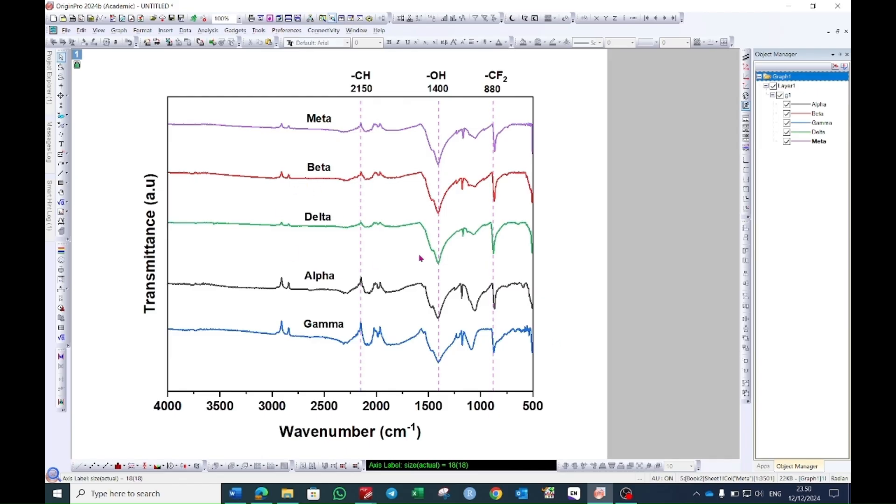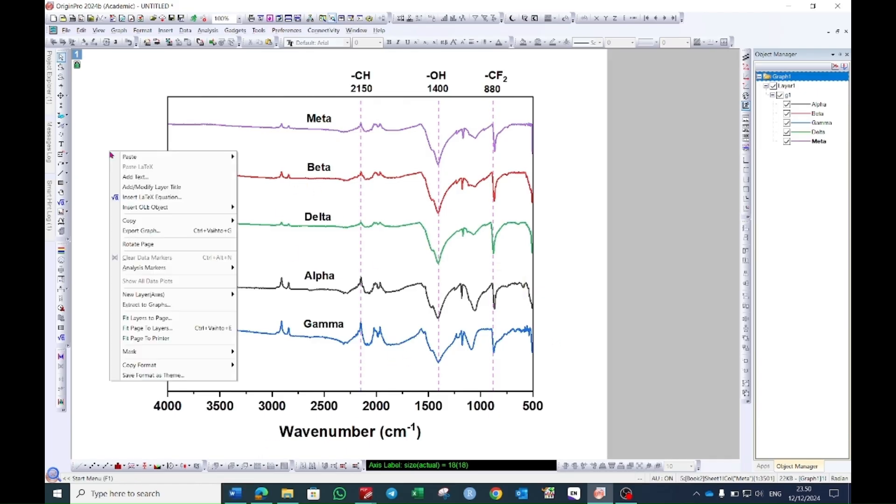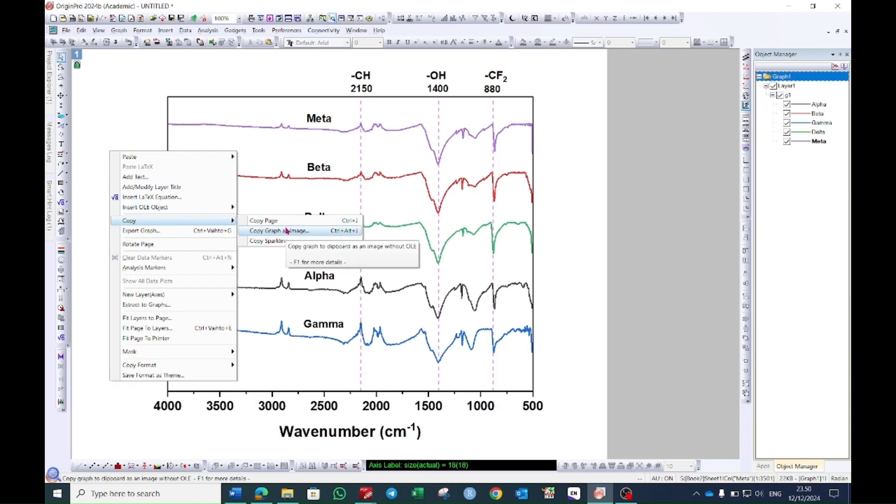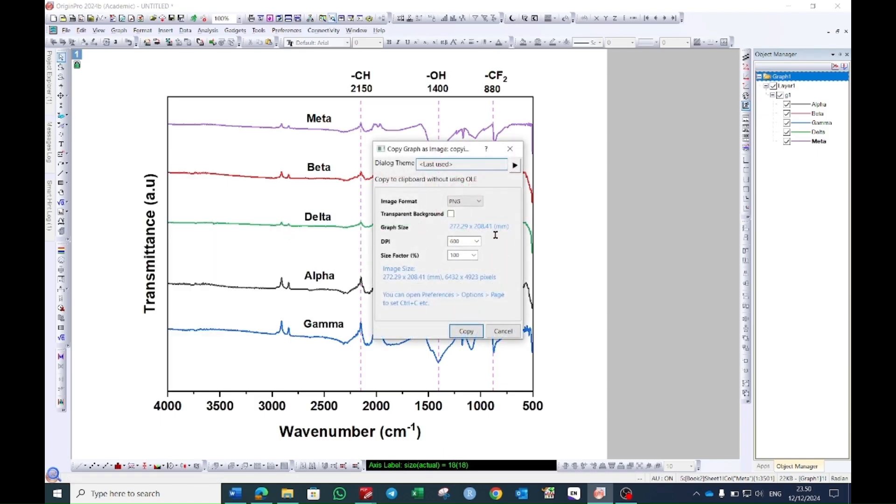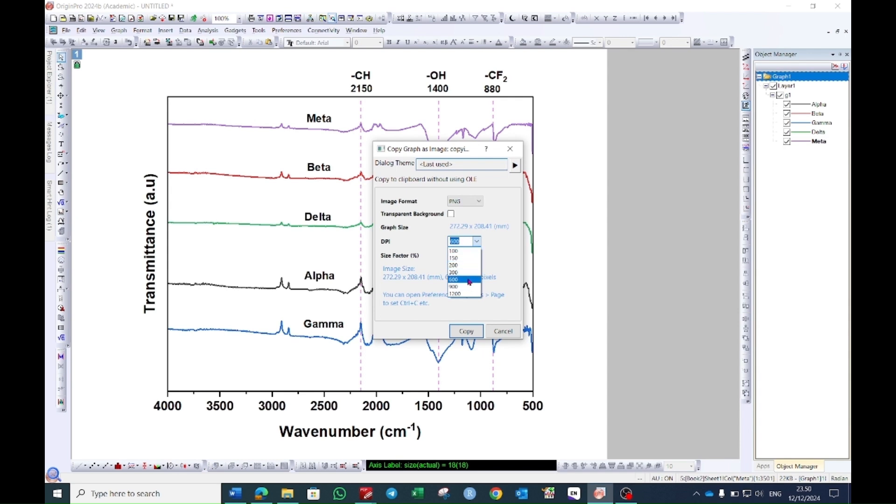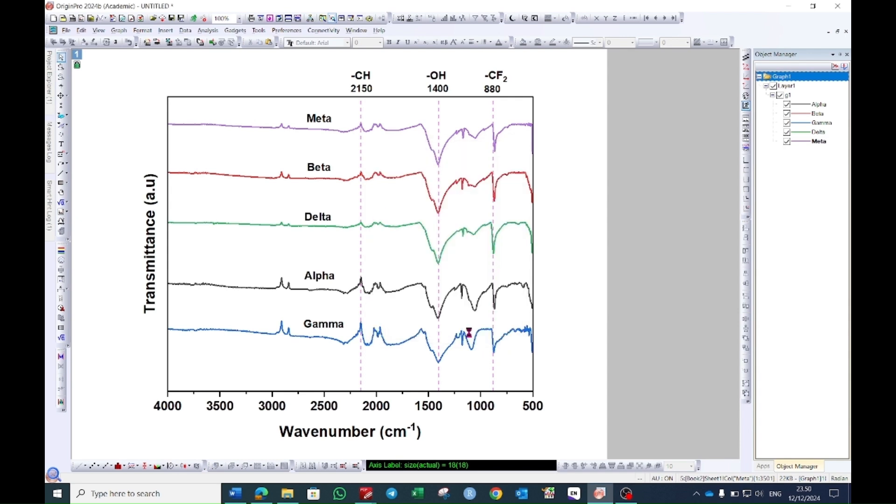If you want to plot this graph in Word, you can right click on the graph then click on copy and then click as and then select copy graph as image. A window will pop up and you can change the type of the image from here. PNG is good and then with the dpi you can change the resolution of the image. 600 is fair enough and then press copy.